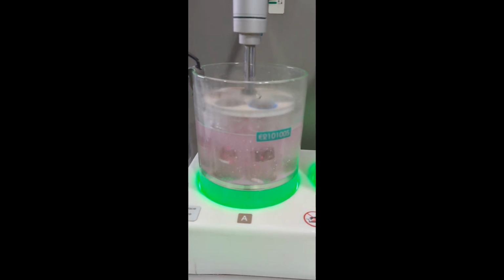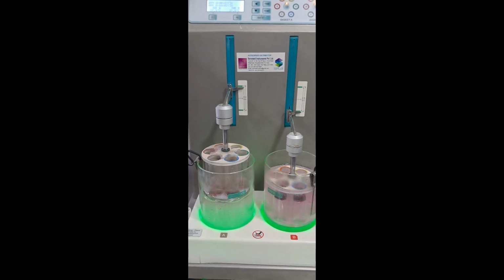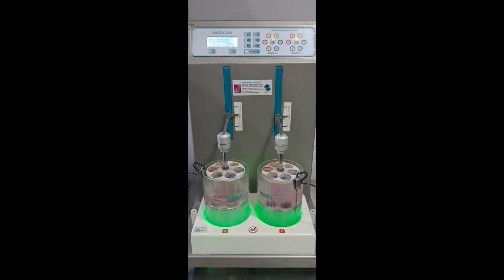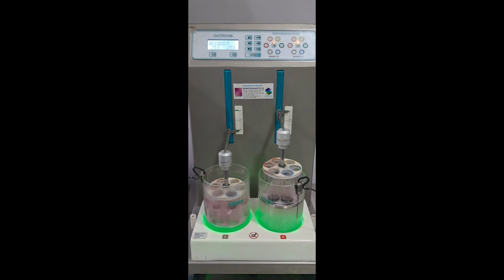Use the correct type of plastic discs for soft gels or low-density powders. Position discs without tilting to avoid uneven fluid penetration. 6. Media preparation and pH.